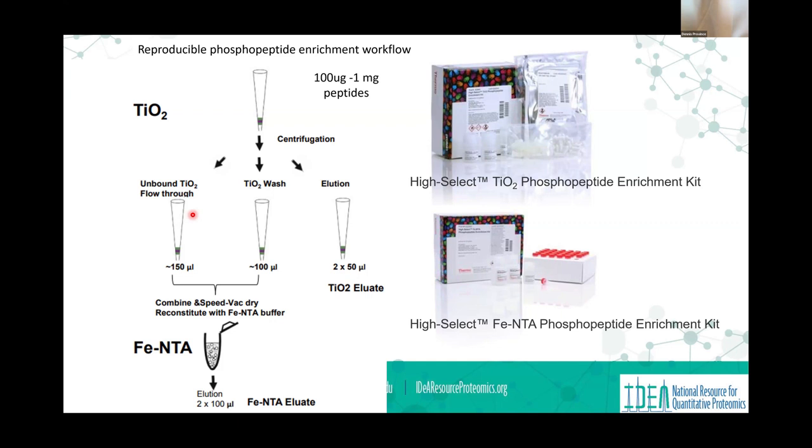And I went to a poster at ASMS a few years ago, showed really good data. I asked what they were using. They said, well, these new kits. Like, oh, they must have new kits. I looked. Now this is the same kit that I'd ordered 10 years before, and it just didn't work. So I started asking questions like, oh, it's the same kit. They changed the buffers. They work now. So, okay, well, we'll see. And sure enough, it works.